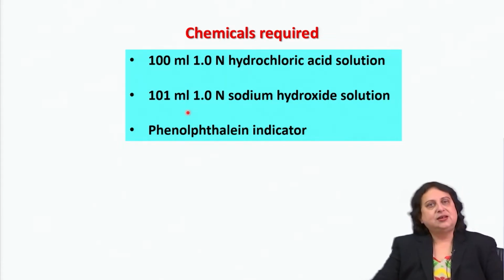And if needed, you can check if your reaction is complete and you have a complete neutralization of the given hydrochloric acid solution. In that case, you can use an acid base indicator such as phenolphthalein, which will be colorless in the acidic medium, but it will assume a pink color if the mixture of acid and alkali is slightly alkaline.